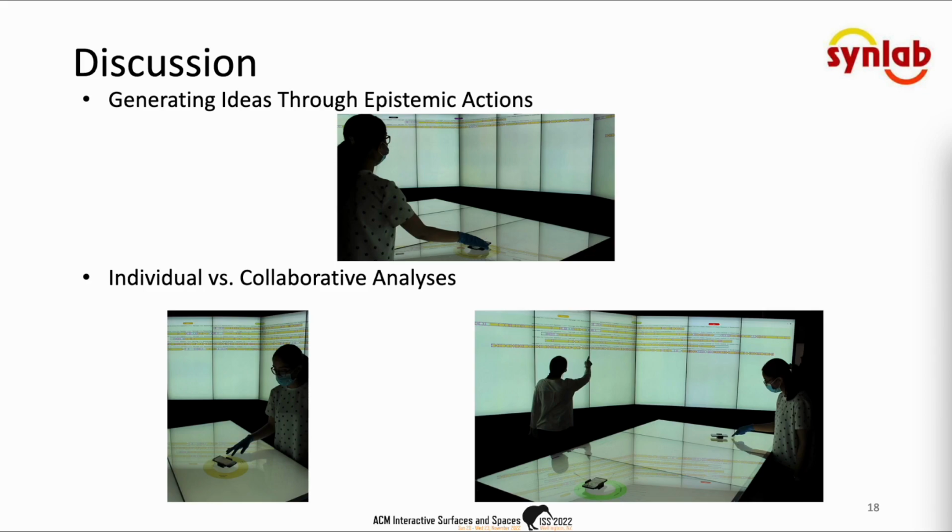They spend time getting acquainted with the data on their own, then bring it to the table for group discussion and interpretation. Tangible Chromatin effectively supported participants in moving from individual to collaborative activities. Working individually, almost all participants engaged in both pragmatic and epistemic interactions with the system. As a collaborative, though, teams shifted to using more communicative interactions than direct interactions with the system. They also shifted from quantitative data to qualitative and comparative statements.